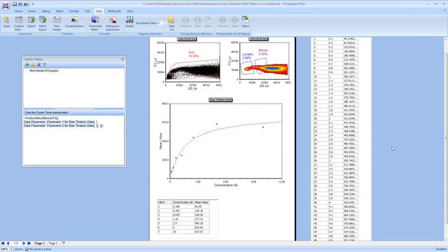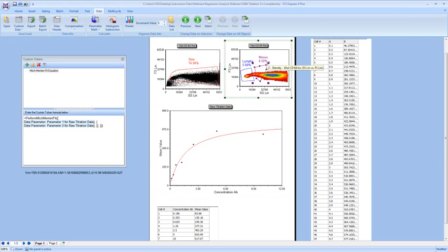And now at this point, anytime you move your gate, our scatter plotting points are going to update, and our trend line is going to update. And you'll notice that in our custom data here all the y values are updating, because our fit parameters are changing as we move this gate, which is going to change our fit parameters here. So that's how we create custom regression overlays within the software.